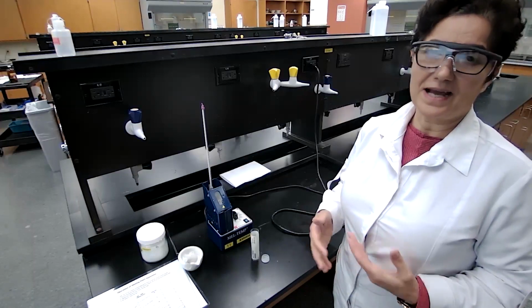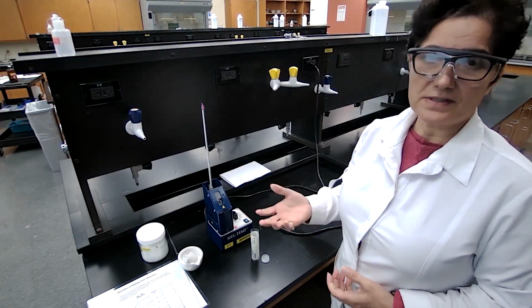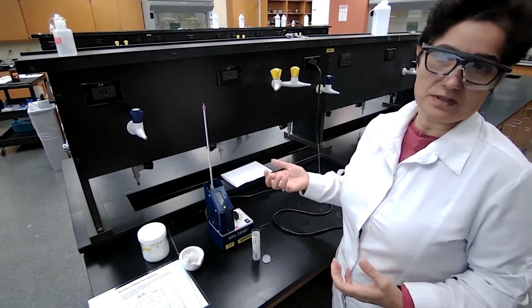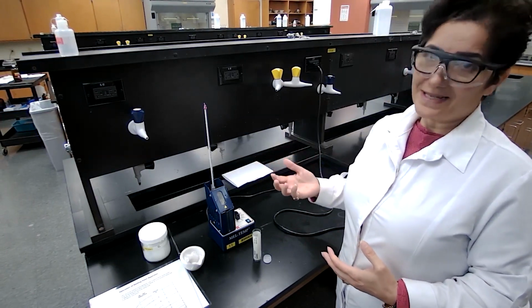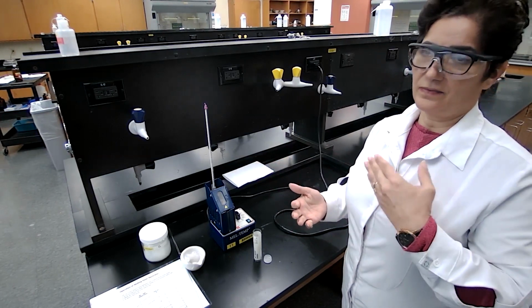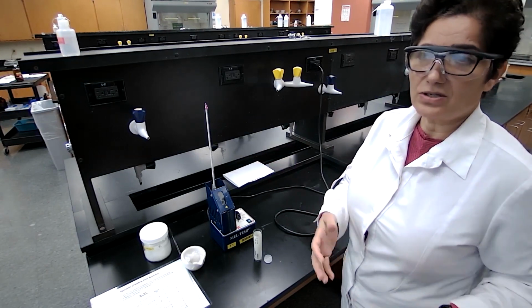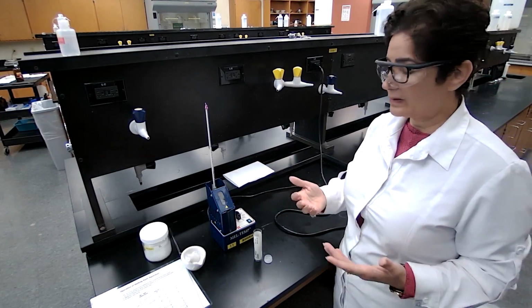If it's not a carboxylic acid, how would you identify it to come up with the exact name? First, we are going to determine the melting point as one physical property, then the solubility. Then we go with the classification test to determine the functional group. And when we have the functional group, then we have to do derivatization, or we do titration in order to find out what it is.